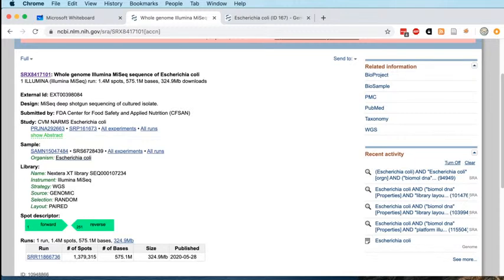And as I said, I've not given a massive amount of thought to the sample that I'm going to download here. I've just searched the SRA for some Illumina E. coli libraries, and this is one of the early ones that I've come across. This is just something that I've just grabbed from the SRA. The important thing is the run ID here. SRR11866736 is the run ID of the experiment that I want to download.